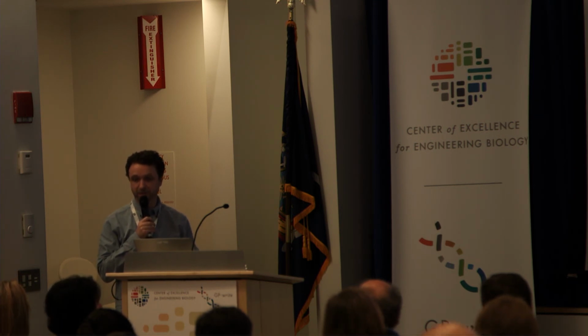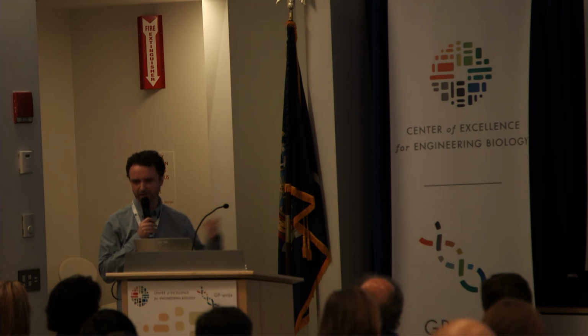When you're pulling out enzymes or pulling out different bits of material, I think a lot of the scalability comes from thinking about the process as well as how that fits into the equipment you have.